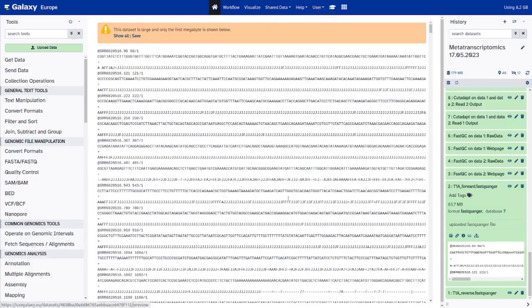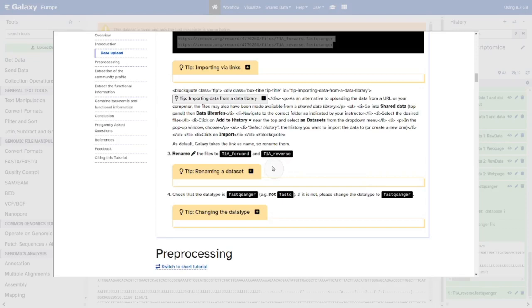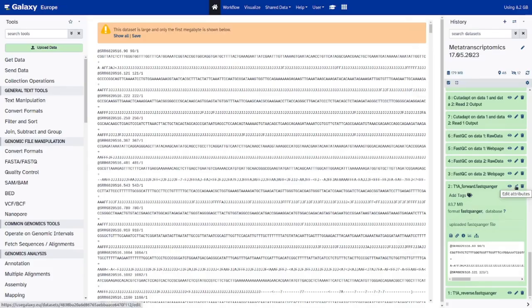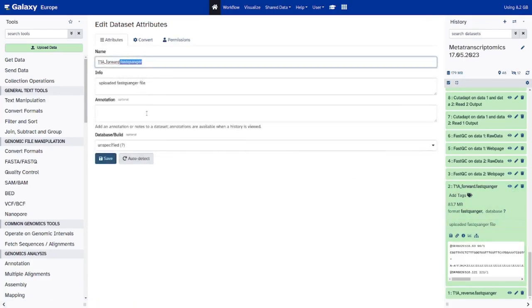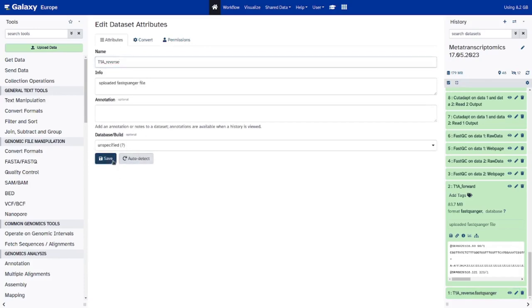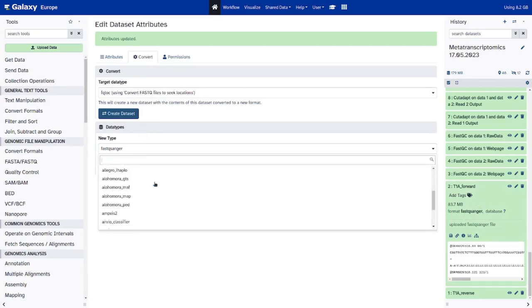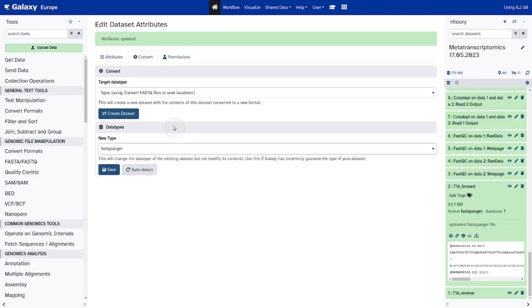Once the data is completely loaded, you can investigate the FASTQ data — these are raw reads from the metatranscriptomic experiment. We may want to rename the files so we can better remember them; for example, call them TA1 forward and reverse. You can rename files by clicking on 'Edit Attributes' and renaming accordingly. Also make sure the file type is correct — it should be FASTQ Sanger. If for some reason it is not FASTQ Sanger, you would need to convert it to the correct file type. Galaxy uses file types to determine which tools can use which files.